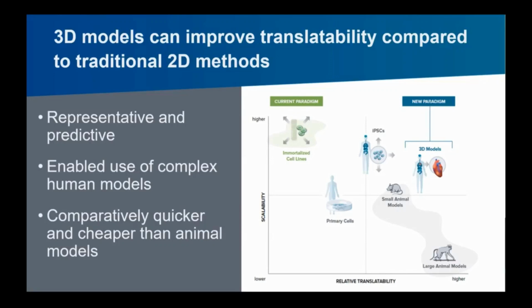This can all have a big impact on cellular behavior, maybe improving differentiation, the cellular phenotype, and expression of specific functional machinery. Ultimately, this can help in vitro models be more representative and improve their predictive power and help increase their translatability to the in vivo state.